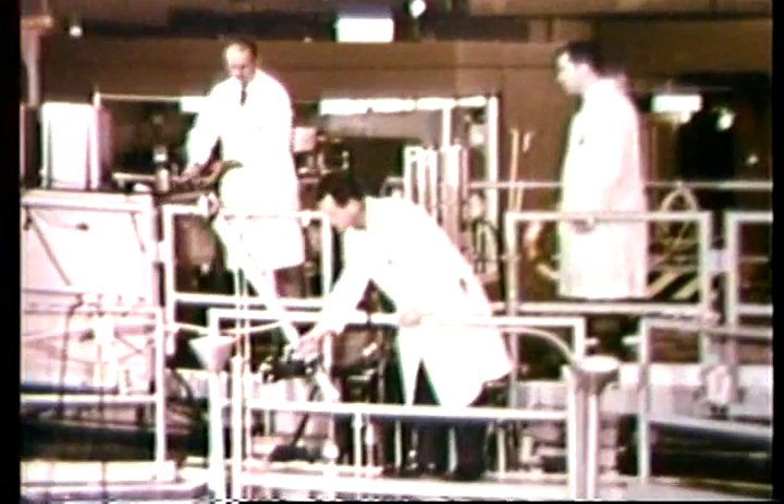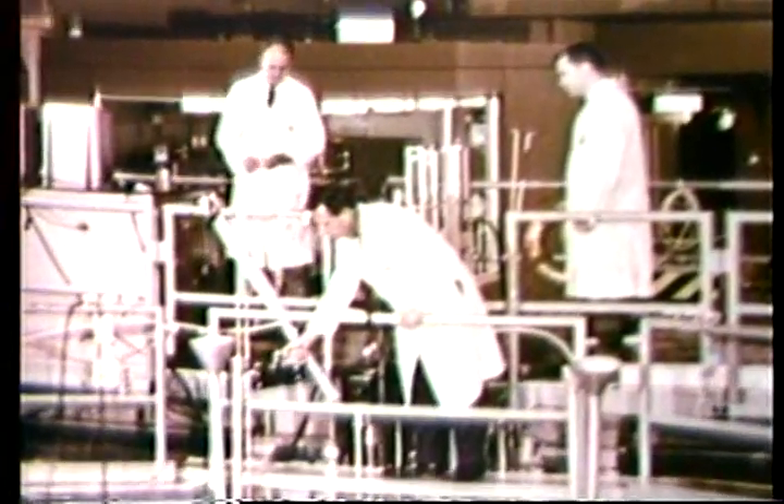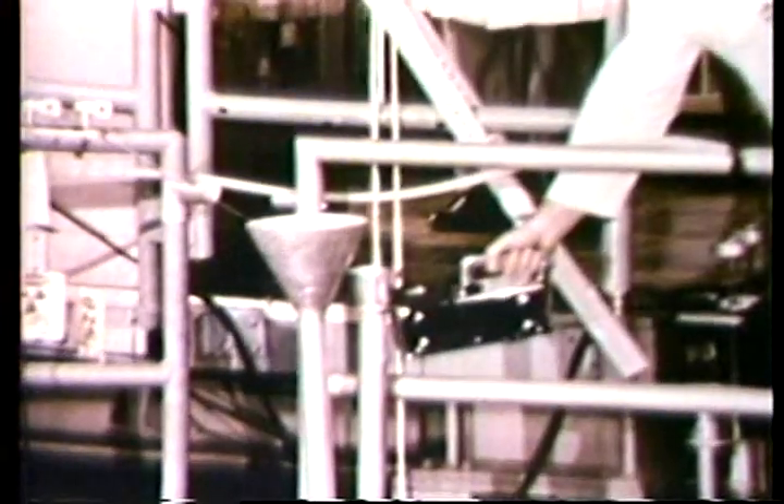The reactor core, deep under the pool which cools and shields it, operates routinely at a power level of one megawatt. After a predetermined time in the reactor core, the now radioactive samples are removed.